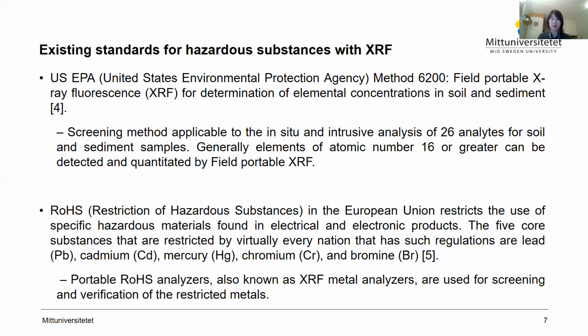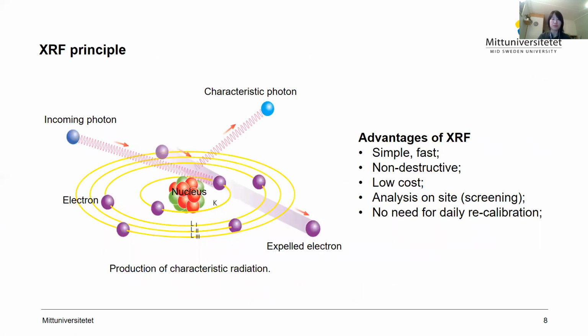This is also widely used as a first screening step for mercury contamination in soil and sediment samples, and in some cases for confirmatory testing. Overall, the XRF field technique provides a significant improvement over current practices to detect mercury contamination.